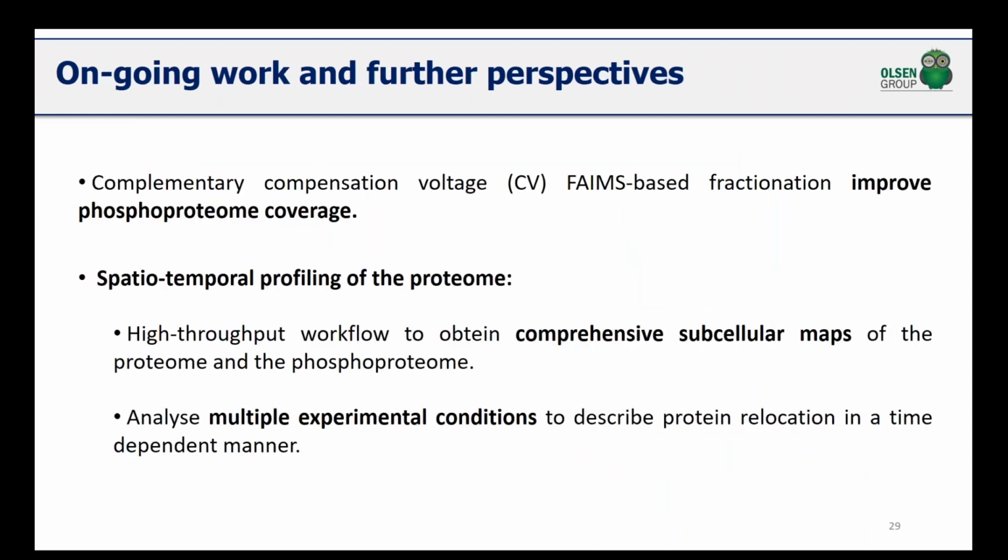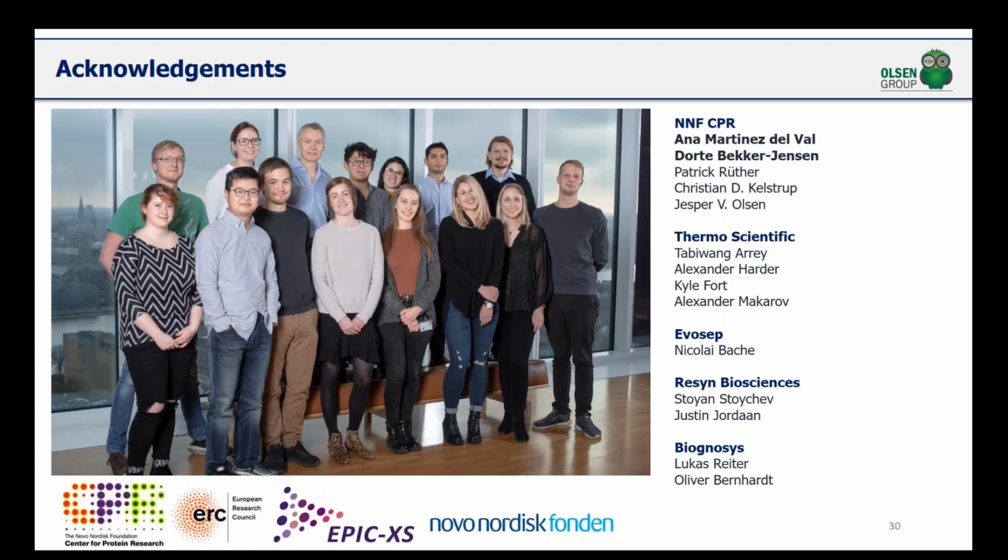And with that, I'll just end with some of our ongoing work and future perspectives. So we are now also looking at different compensation voltages, FAIMS, to fractionate phosphoproteomes on the fly. And obviously, we're very excited about the spatial-temporal profiling of the proteome, where we can do high throughput workflows now to really comprehensively look at the subcellular localization and movement of proteins. And we're analyzing multiple experimental conditions now in order to describe protein relocation in a dependent manner.